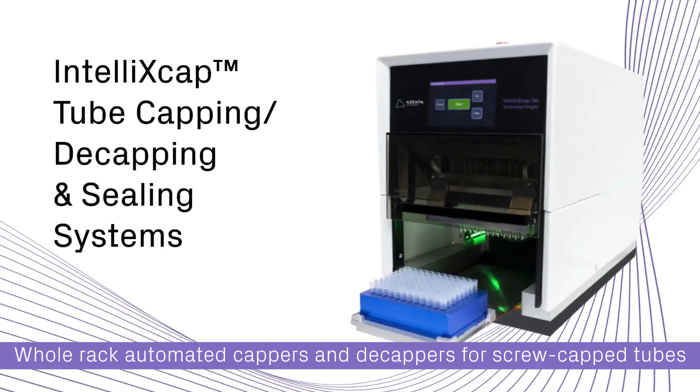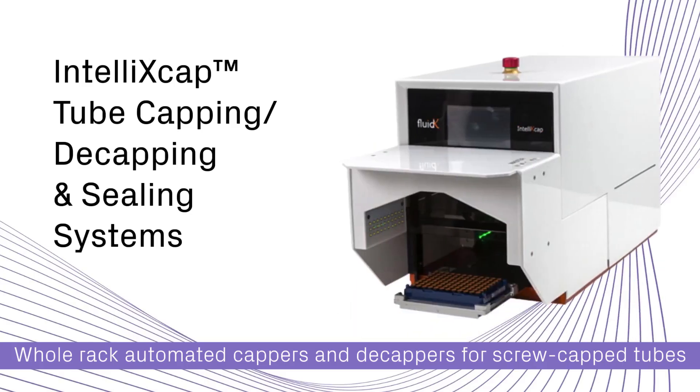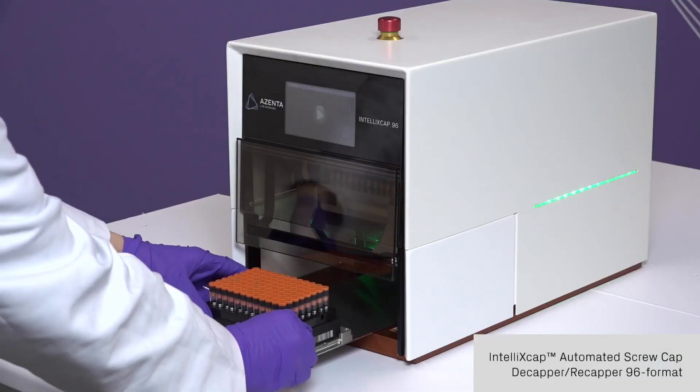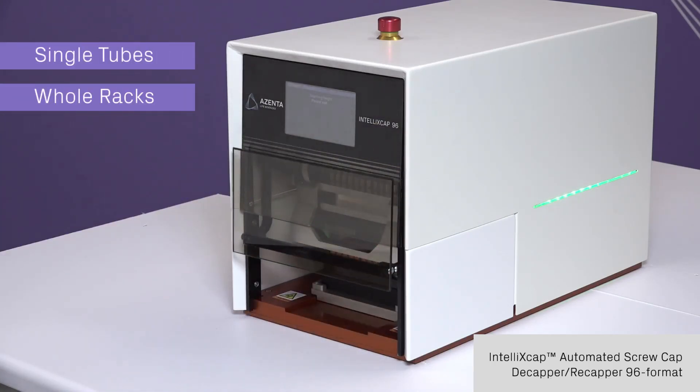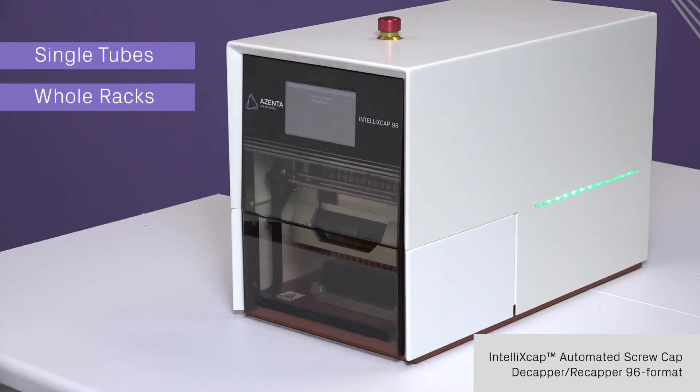Improve productivity through cap and decap automation with an Azenta capper-decapper unit. From single tubes to whole racks, we can help you automate the tedious business of capping and decapping hundreds of tubes each day.